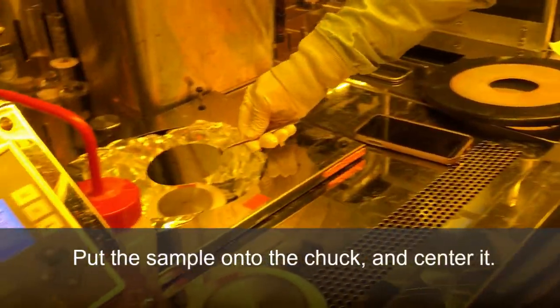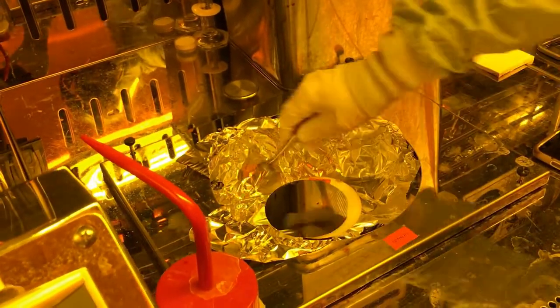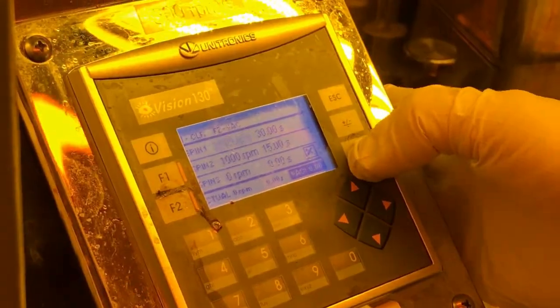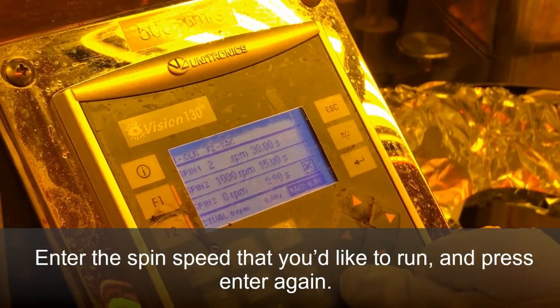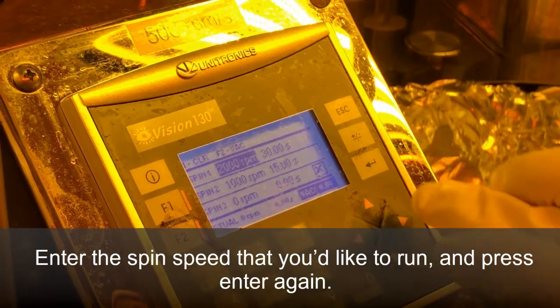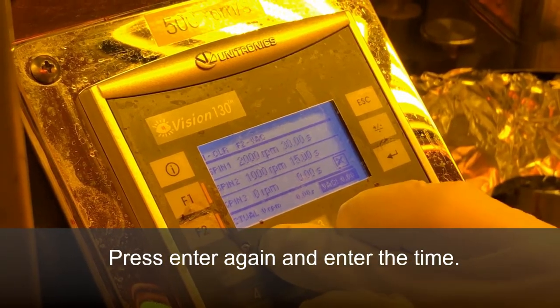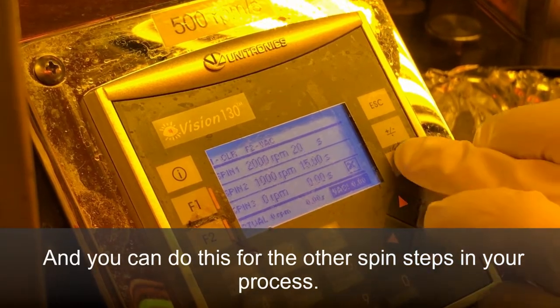Put the sample onto the chuck and center it. Press the return key to put the controller into edit mode. Edit the spin speed you'd like to run and press enter again. Press the arrow button to go over, press enter to put it into edit mode and enter the time. You can do this for other subsequent spin steps in your process.